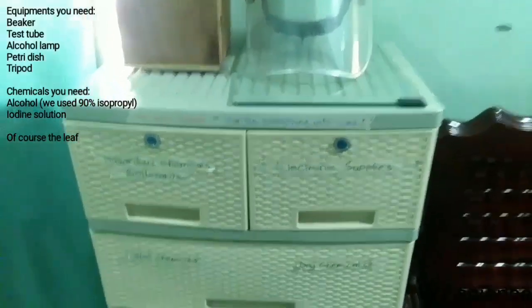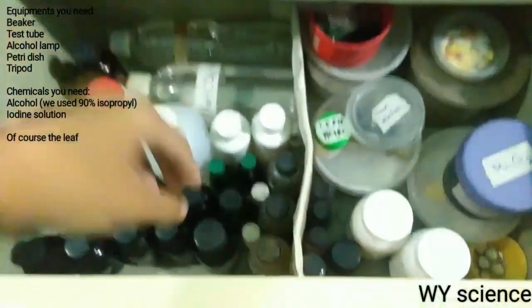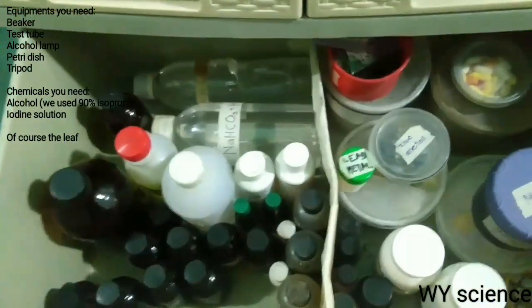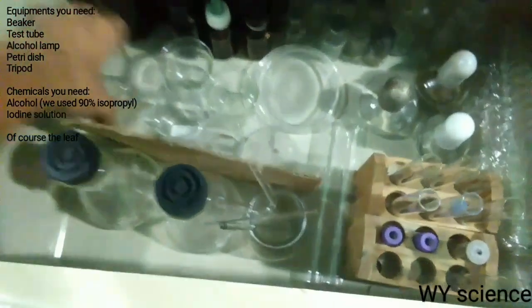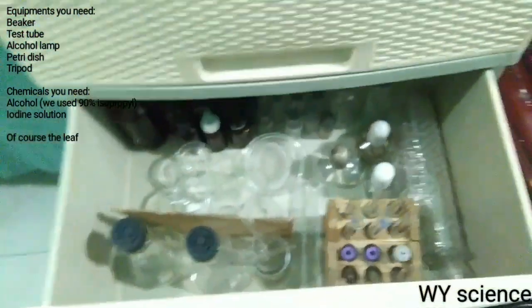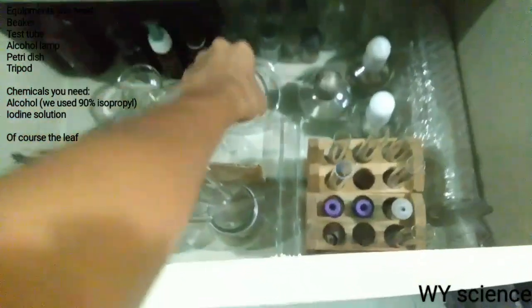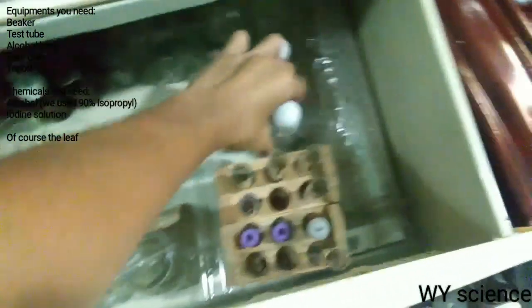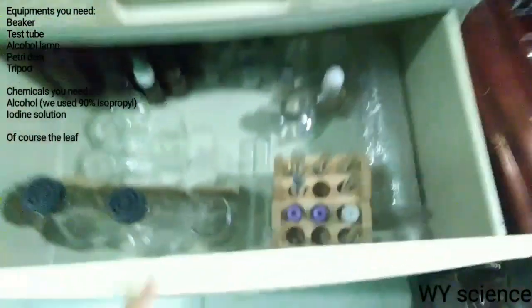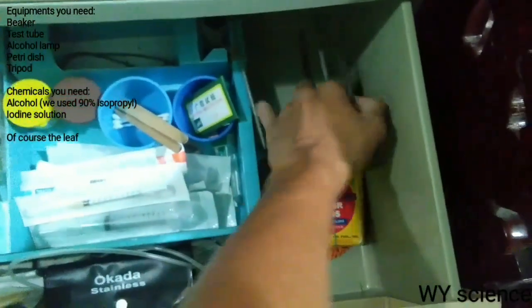The experiments and chemicals we need are alcohol and iodine solution. We also need a beaker, a test tube, a petri dish, and an alcohol lamp. Lastly is the tripod with a wire gauze.